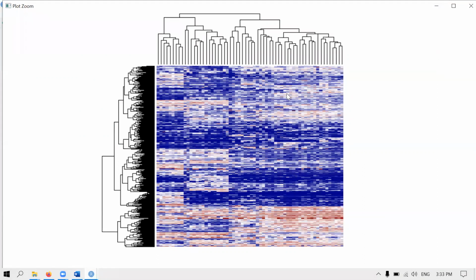So using this heat map, we just want to have a quick visual of how many groups there are. That means how many vertical lines you can draw to separate the groups. We can see that there may be one large chunk group here. Then this may be one group because it looks very different. The next group will be this one, which is very different. You have some missing. But let's say in this large chunk itself, we can see that there's somehow a little separating line between here. This group is kind of similar yet different from this group at the end of it. So it seems that there may be 3, 4, or 5 groups. We do not know, but it's a diagnostic.